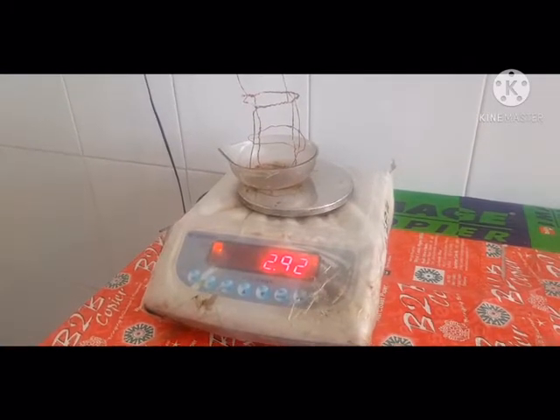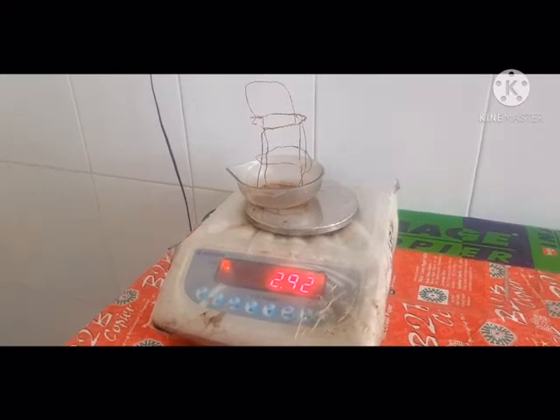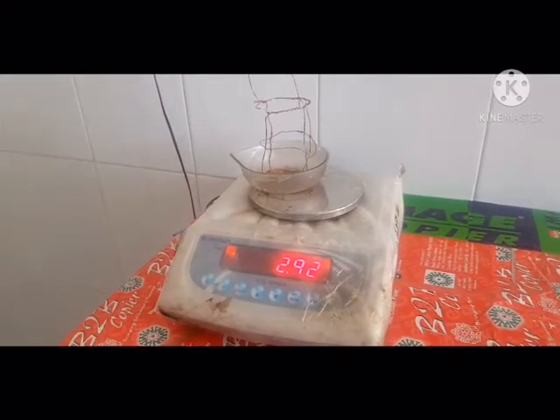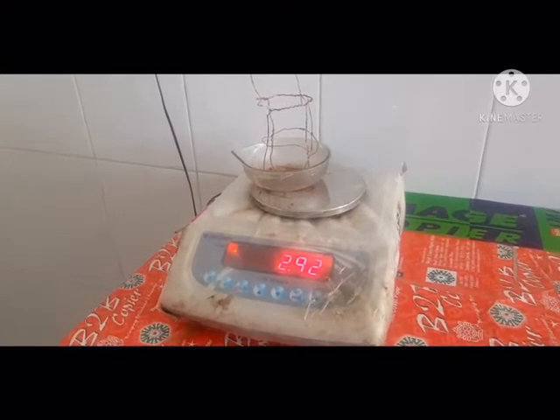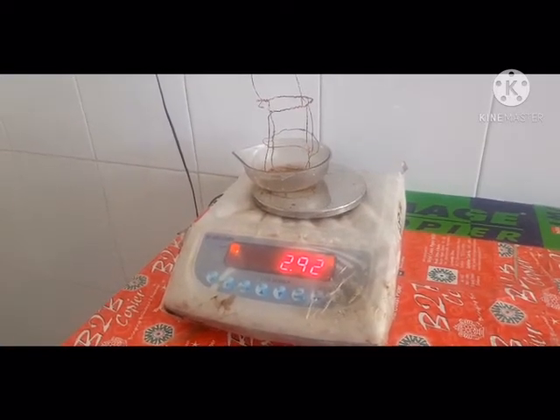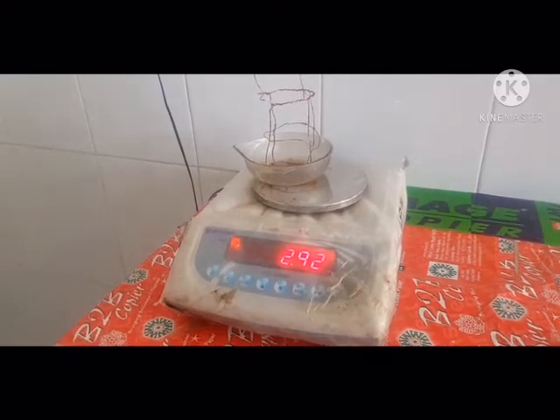The copper wire basket should weigh around 3 grams and must not exceed 2.4 to 3 grams. This is a mandatory requirement for the absorbency of cotton wool IP practical.